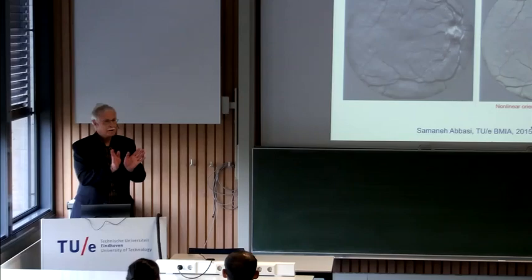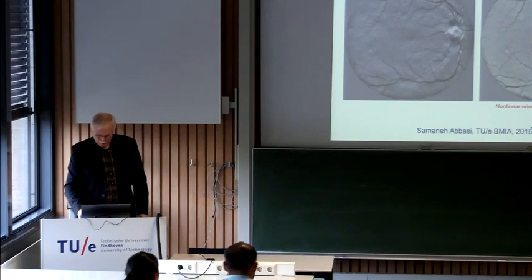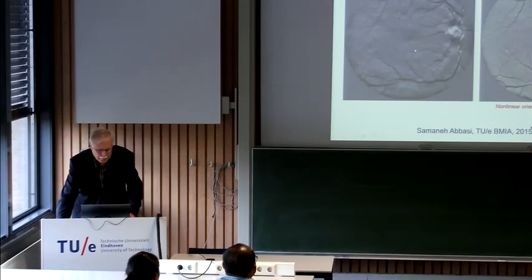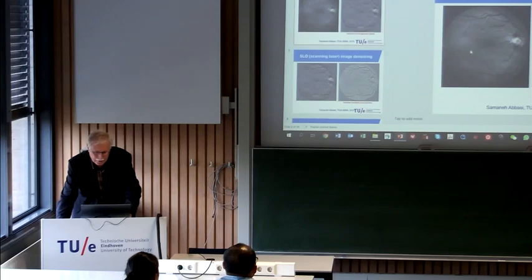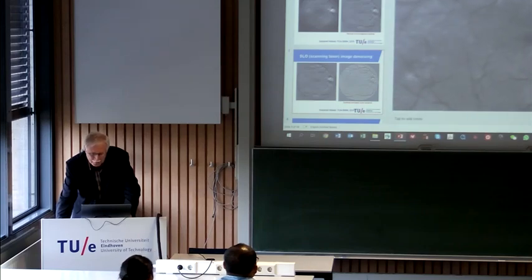But even the crossings, because we have this multi-orientation, it doesn't matter because they're in different fields. So that was nice. We had a nice denoising, and you see that images from a laser scan are quite noisy. Suppose I take this image, I go back, this one, and suppose I zoom this guy out. You see the noise?